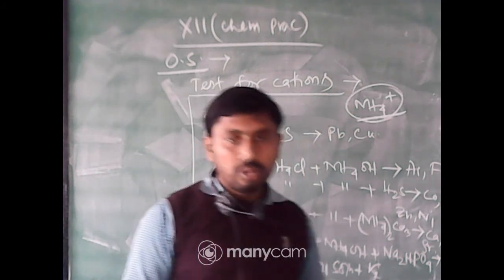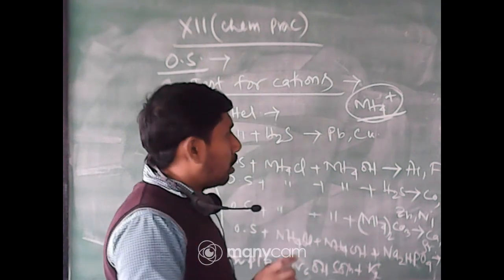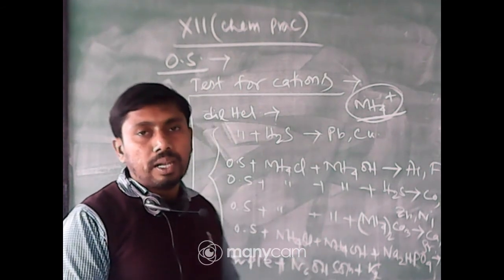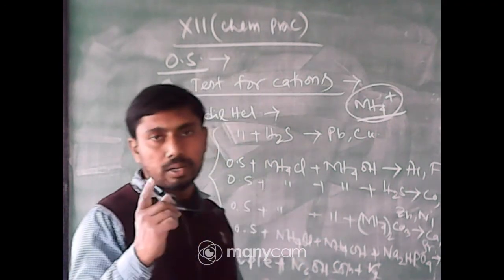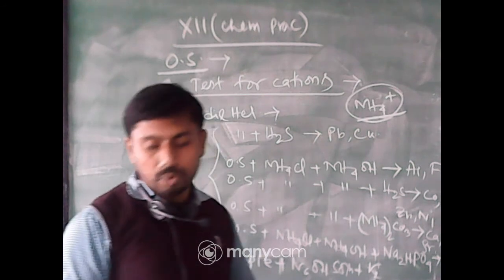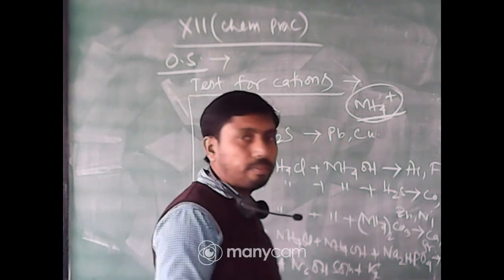And you will also do it in the dry test section, that is sample plus solid NaOH pellet, and the smell is of ammonia. Okay. So, in these two experiments, first the dry test, and this is the wet test, that is NaOH solution plus K2HgI4, the brown color PPT. This is also the confirmative test for ammonia.